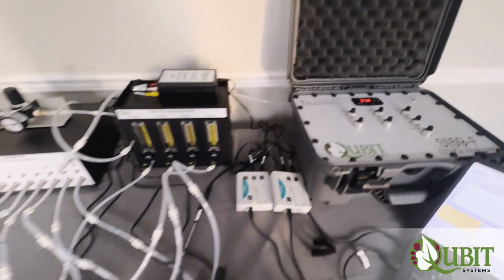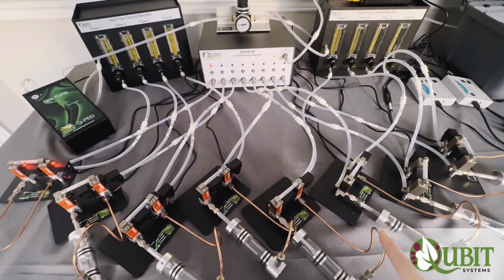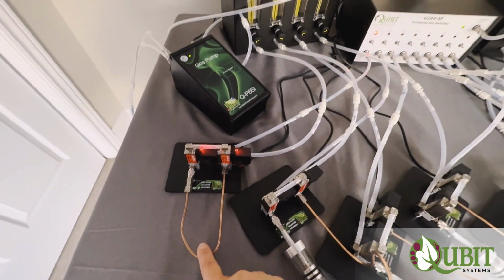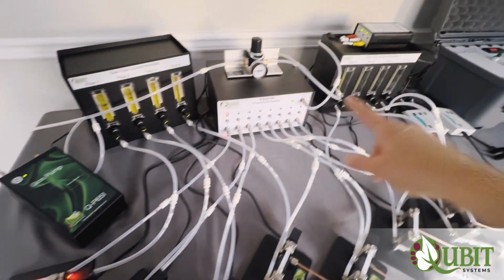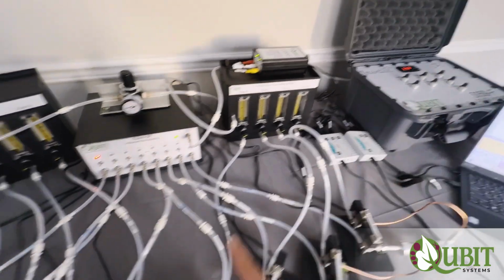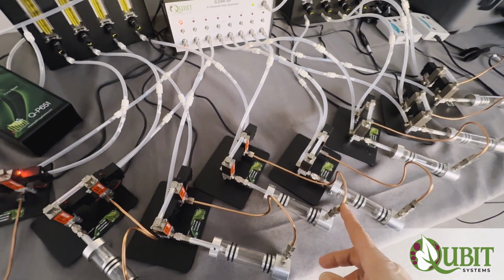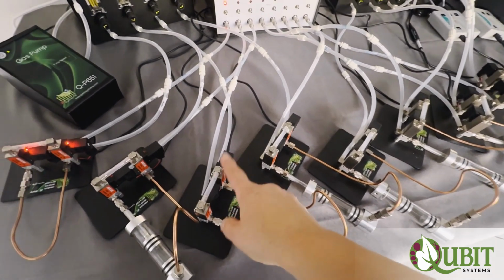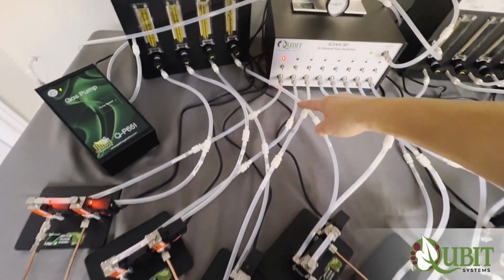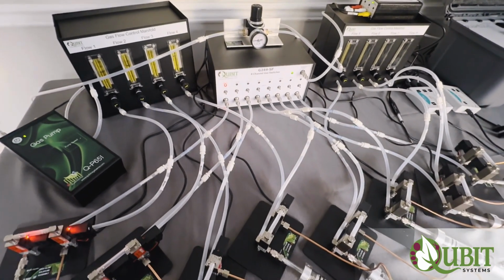So as mentioned before, with the stop flow system, what is happening is the gas is being carried from the selected channel, so in this case channel 1, through the gas switcher to the S159 analyzer, and all of the non-selected channels are in the stop flow mode. So the gas bypasses these chambers and just goes directly from the flow meter through the solenoid valve assembly into the gas switcher, and then vents through these vents. So that's what stop flow means.